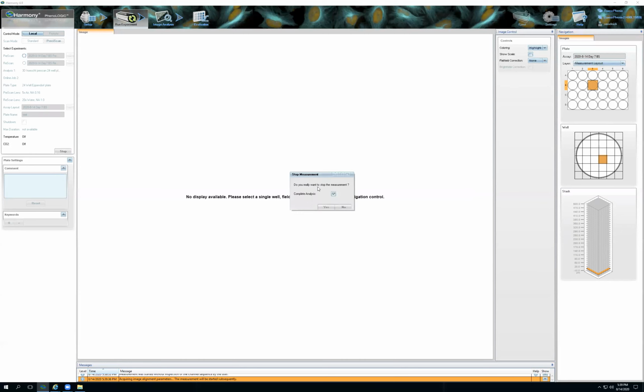Oh, so one thing that is really important is, I just imaged it on the 20x water. So now there's going to be water on the bottom of my plate. So I'm just going to hit eject. I'm going to wipe off the bottom of my plate to remove all the water, and then I'm going to re-image.